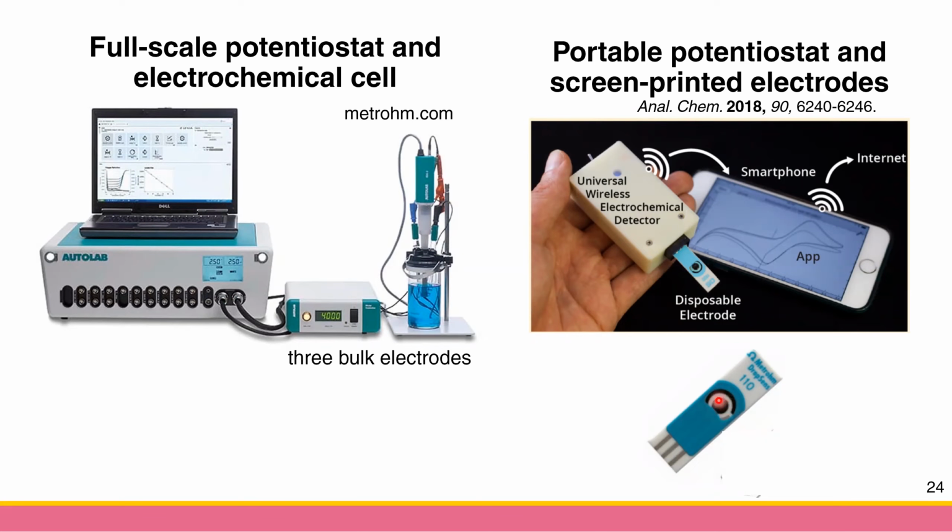The black area in the middle is the working electrode, and this grayish color is of course the color of the silver chloride ink. So this is the silver chloride ink reference electrode, and the outer black here is also carbon. I think it's the carbon counter electrode. The middle here is the carbon working electrode.